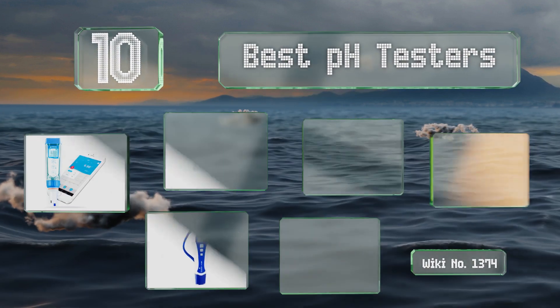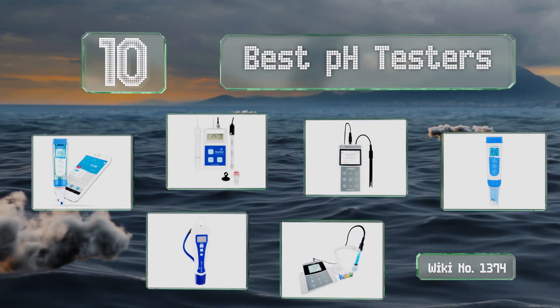EasyVid presents the 10 best pH testers. Let's get started with the list.